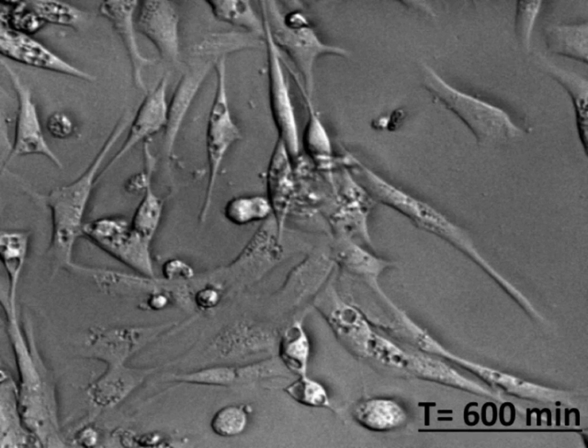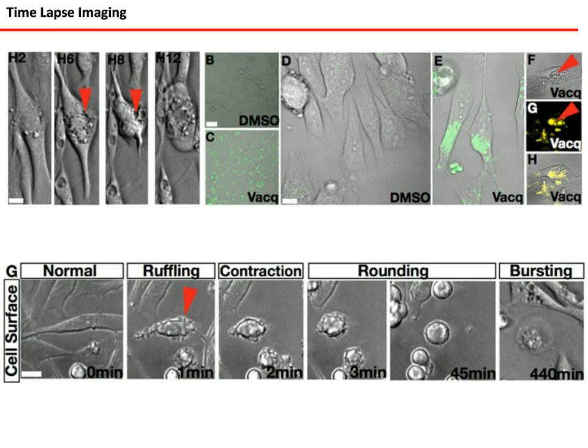So when you actually look very closely, we could see that vacuoles were getting accumulated inside the cell. So we wanted to know how these vacuoles were coming. Are the cells taking in liquid from outside and collecting it inside, or was it some internal process? Just to evaluate this, we added a dye called Lucifer yellow.